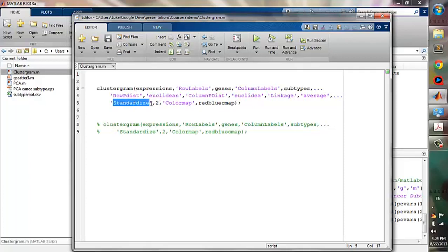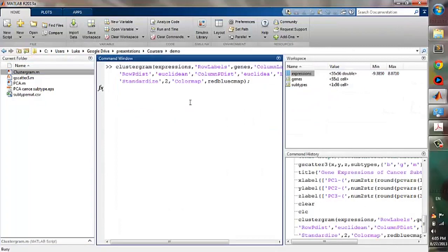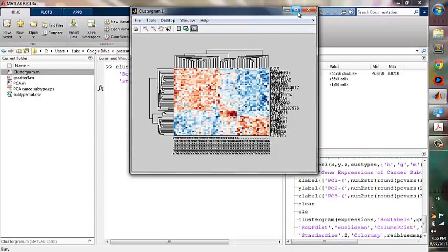Then we specify standardization. I give it a number 2 here because in MATLAB, number 2 means row-wise standardization, while number 1 means column standardization. The color map, I will use red-blue cmap. Traditionally, it is usually red-green, but now red-blue is more popular to accommodate red-green colorblind people. Okay, now I will copy this command and paste it into the command window and press enter to run it. Okay, now we got our figure.